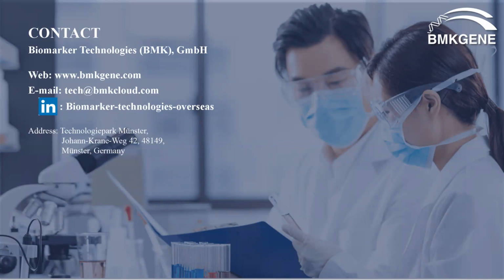And then the last question would be, is it a problem data analysis wise if it's mixed tissue? So this would be the majority zebrafish tissue, and then you'd have some human tumors in there. Okay.